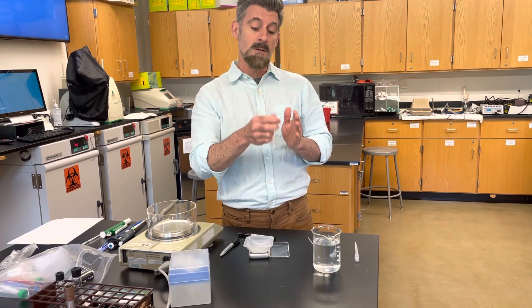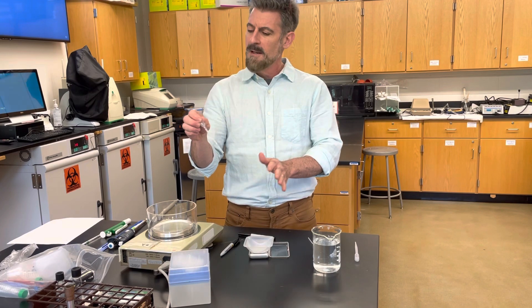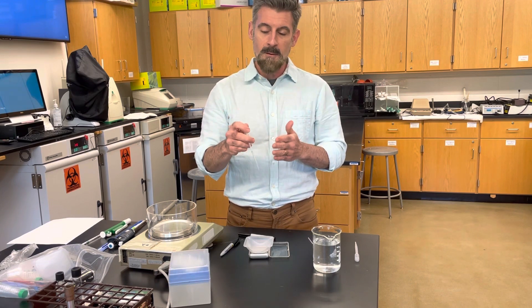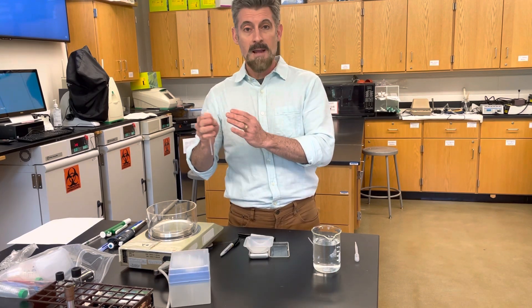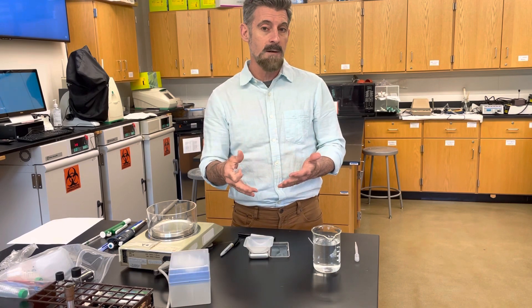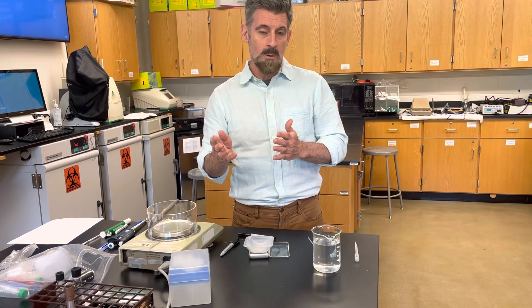What we're going to do is a laboratory that both looks at pipetting and helps you practice your pipetting technique, because when you do this in future labs it has to be fairly precise. This lab is really about precision versus accuracy, and we're going to use the weight of water as a way to calculate those two things.